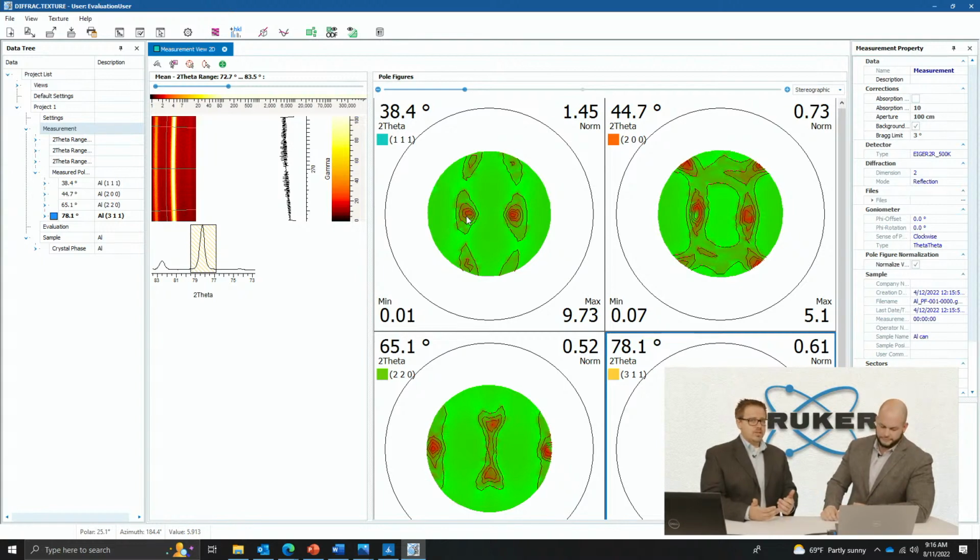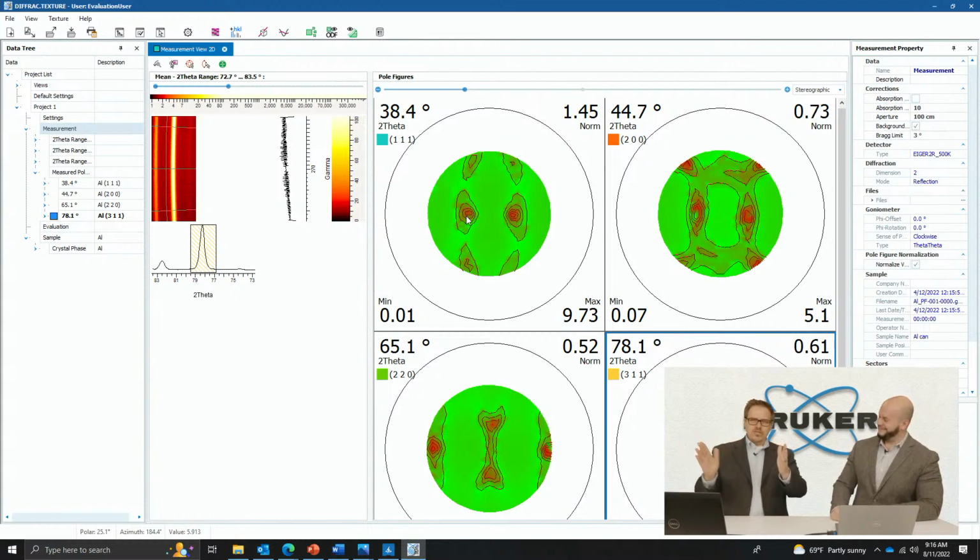And the way I like to think about it, spherical harmonics is actually a math that was developed during the quantum era of science, when they were thinking about orbital theories of electrons and things like that. So basically, they made these shapes. Some of them look like ice cream cones. Some of them look like donuts. Some of them are combinations of these things. And back when they were thinking about texture, they said, you know what? If we flatten those out, it kind of reminds us of the pictures that we're getting. And then if we add different orders of that, as we add more and more of these spherical harmonic components, it fits it pretty well. So it's basically a mathematical approach to fitting this texture.